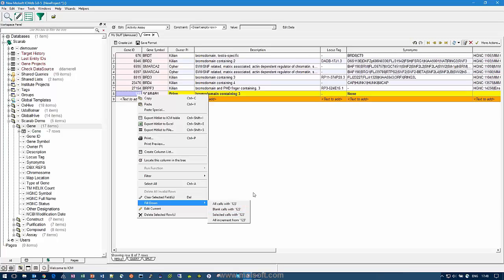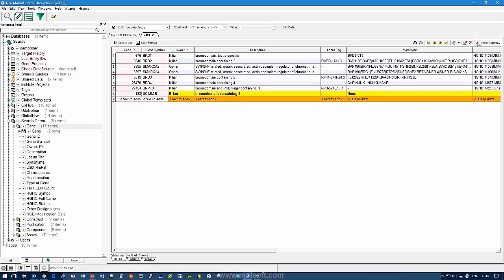So that's pretty cool too. When you're done, you hit the tick button, and it's in. Simple as that. So nothing goes into the database until you hit the tick button. So that's how we enter data.